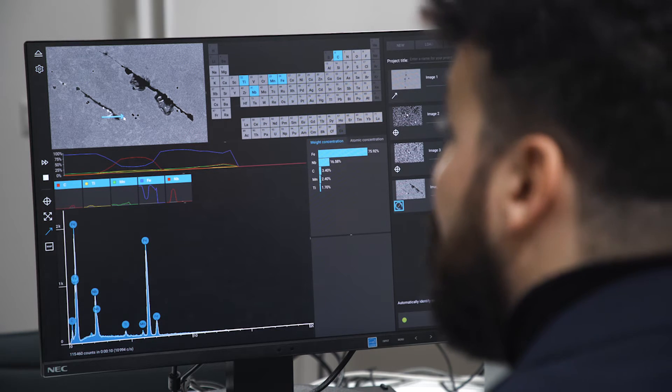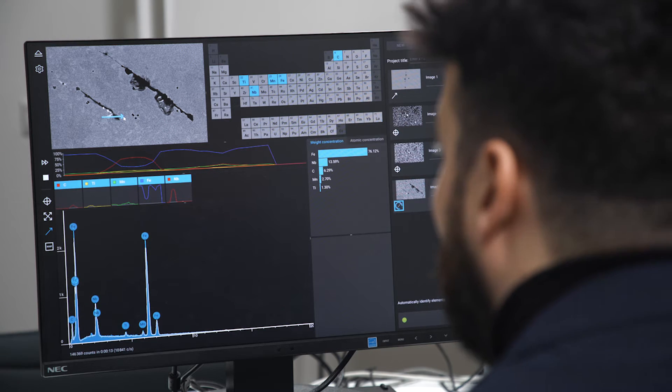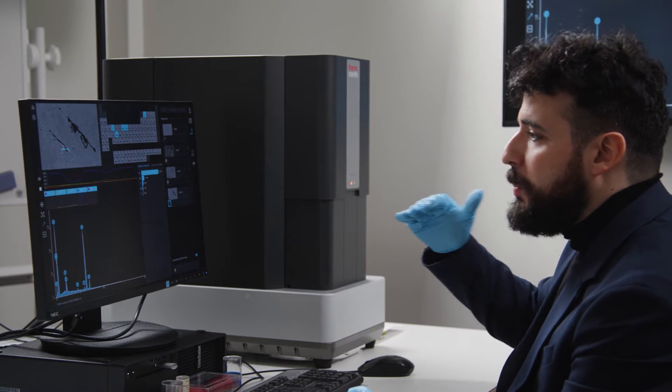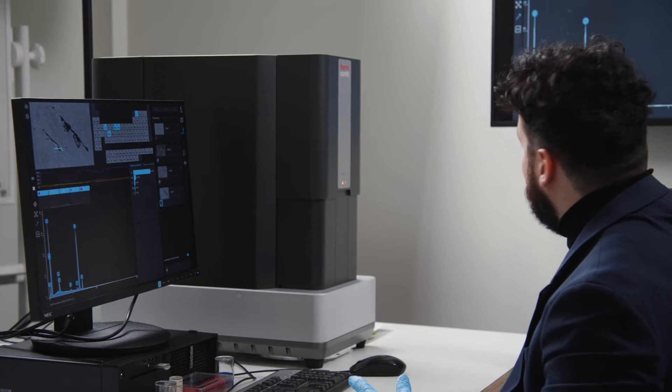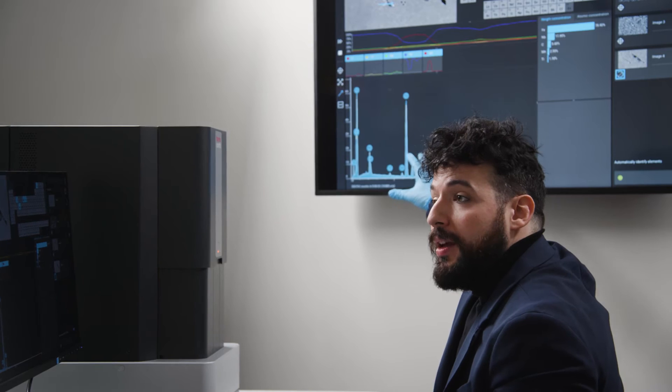In this case we're looking at an inclusion in a steel sample and you can see the different chemical profile building up and being displayed on screen. As the analysis goes on, more and more counts accumulate in the spectrum, which makes our analysis more accurate over time as the beam keeps scanning the surface and generates more X-rays.